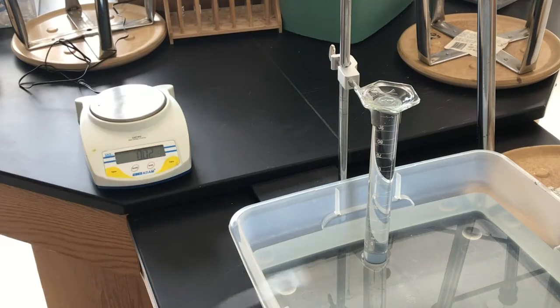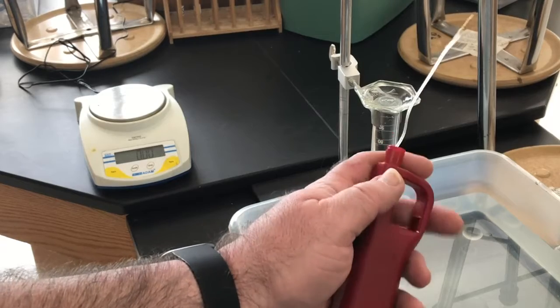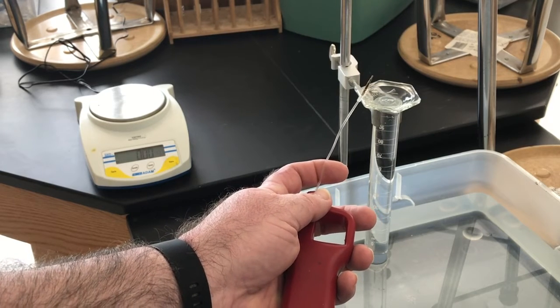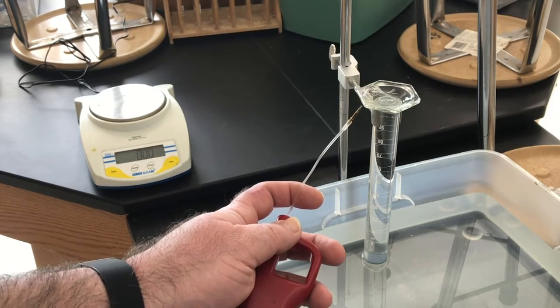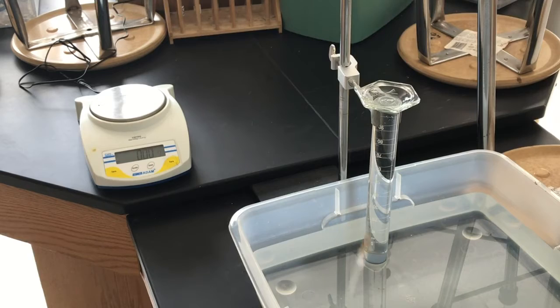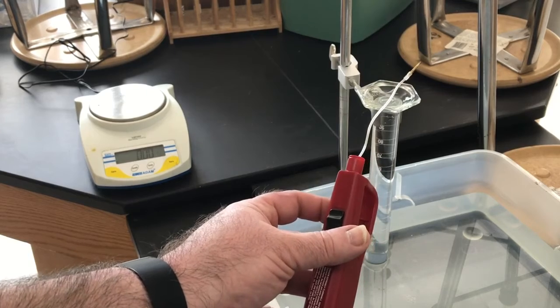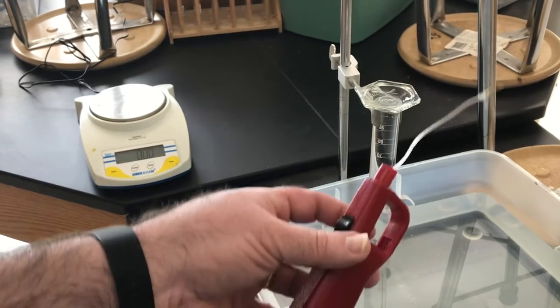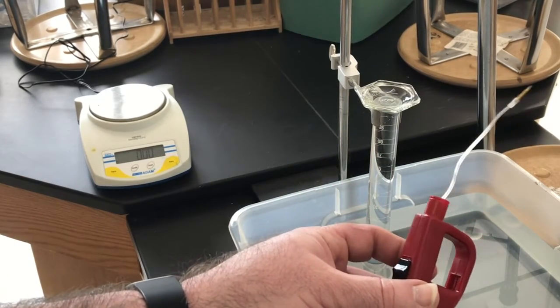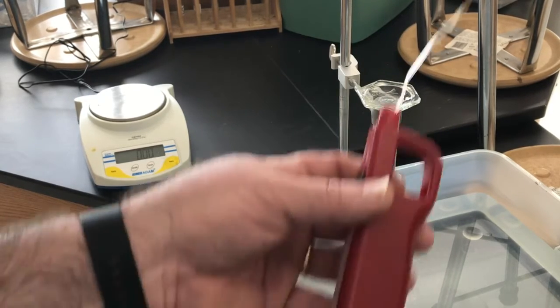Now what I'm going to do is release some of the gas by pushing on the trigger here, through the tube, and that tube will be up inside the bottom of the graduated cylinder. I'm going to collect the volume of gas, and then we're going to do some calculations and try to figure out, ultimately, the molar mass of butane. Molar mass means grams per mole. So we need to know grams, which is why I put it on the balance, and we need to know moles. We're going to calculate the moles using the ideal gas law. You guessed it. And partial pressure as well, right?